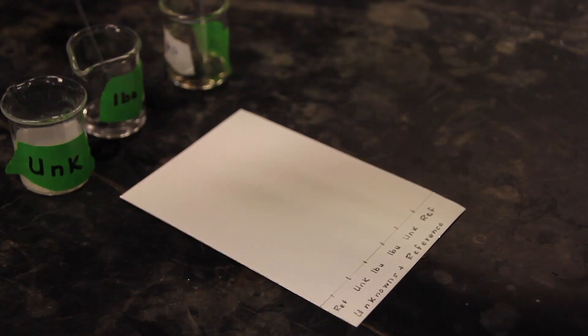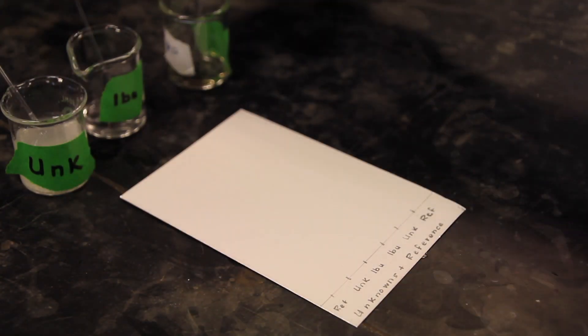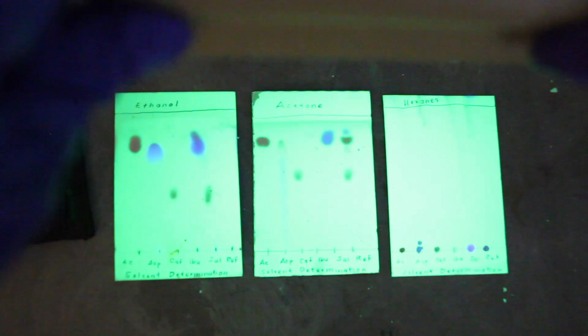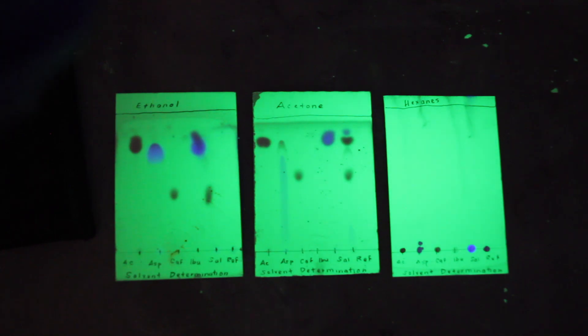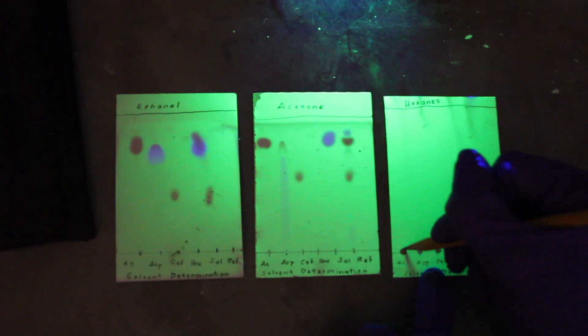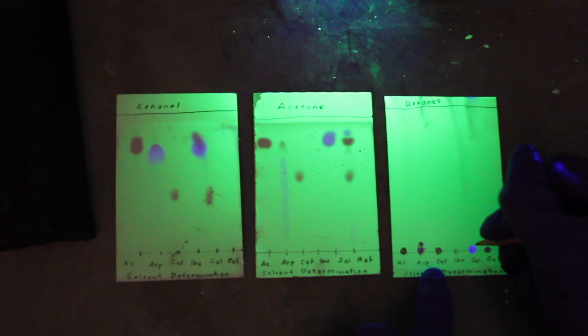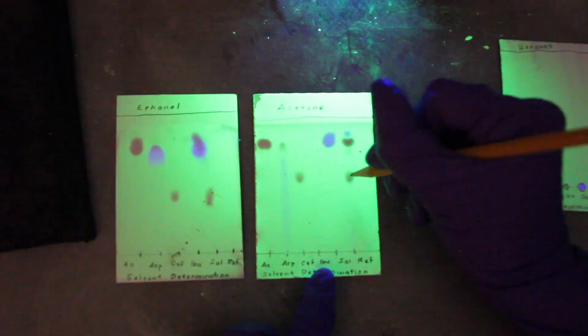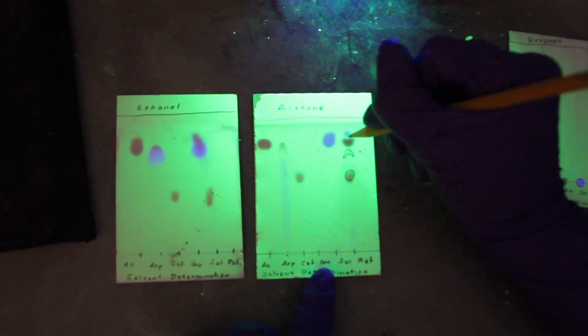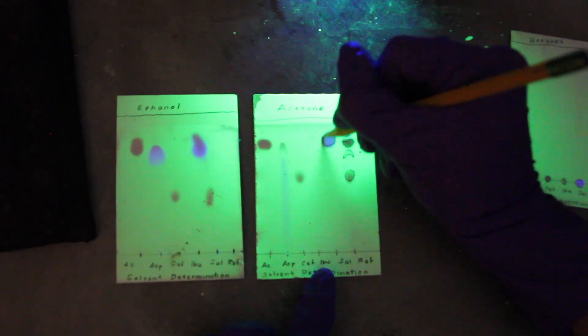Since all of the compounds under analysis are colorless, some method must be found to visualize them on the developed TLC plate. The plates will be placed under an ultraviolet lamp, and the positions and colors of the spots observed. The silica gel on these plates contains a fluorescent indicator, so the plates will have a faint glow under the UV lamp. Non-fluorescent compounds will appear as dark spots. If any of the compounds are fluorescent, which is the case for at least one of these in the experiment, its spot will glow intensely blue under the UV light.